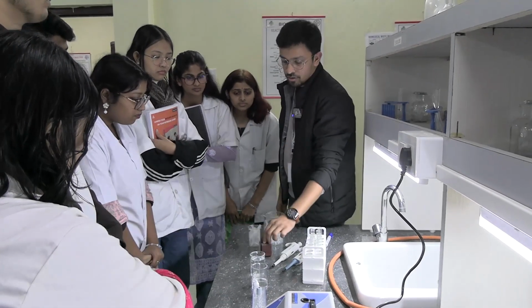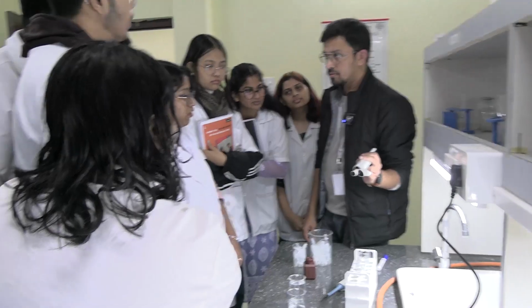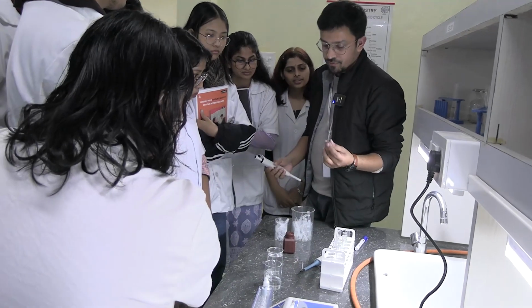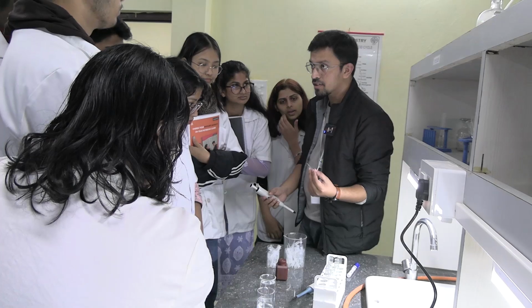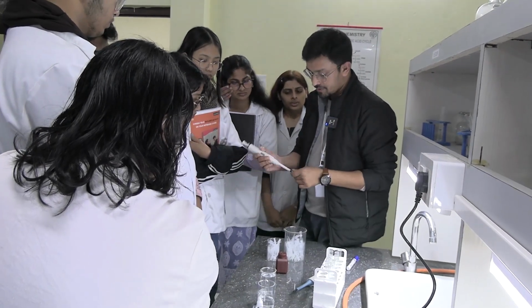Okay, so first of all you see how much is marked over here. 1000 microliter means 1 ml. Fine, this is for 1 ml and this for the microliters, like 10 microliters, 20 microliters. For those we will use these small pipette tips. Okay, that's this, fix this.